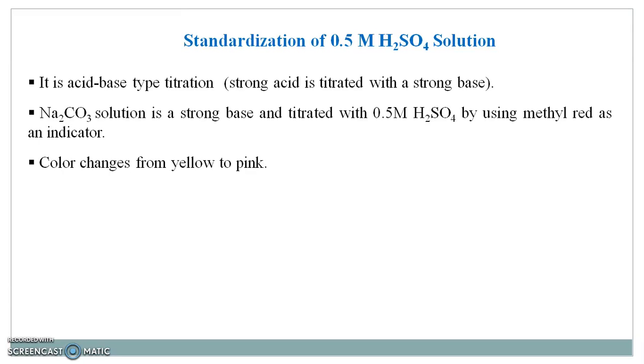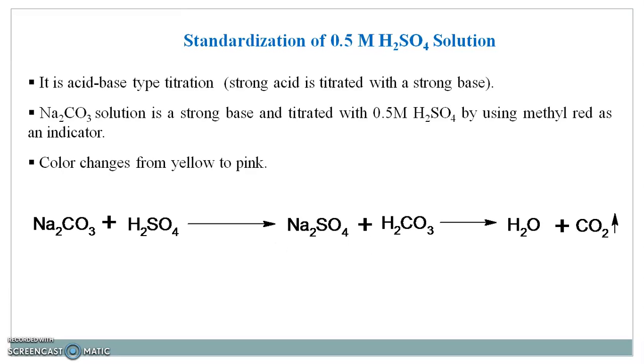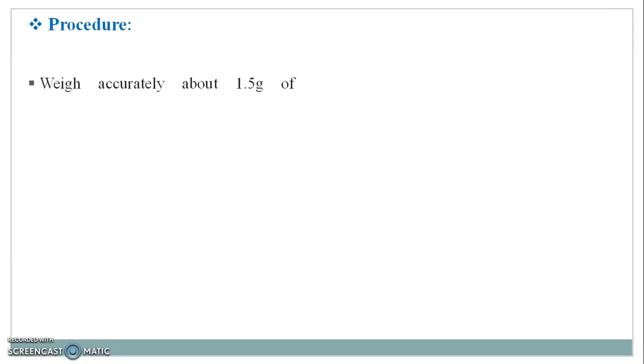When sodium carbonate is titrated with sulfuric acid, this reaction is involved. Sodium carbonate reacts with sulfuric acid to form a salt, sodium sulfate, and carbonic acid, and this carbonic acid further decomposes to liberate carbon dioxide. Now next is the procedure for the standardization.